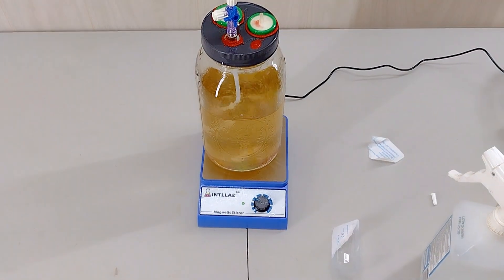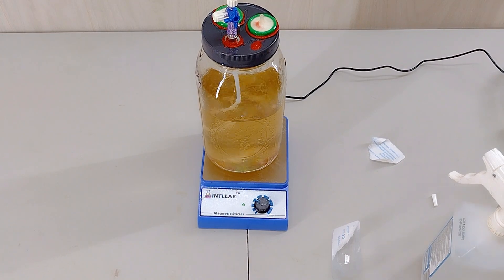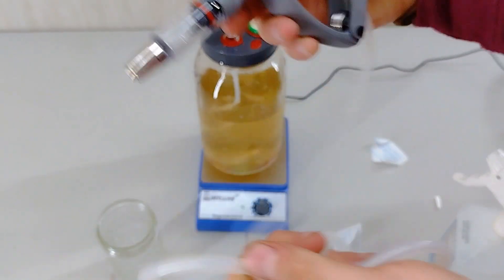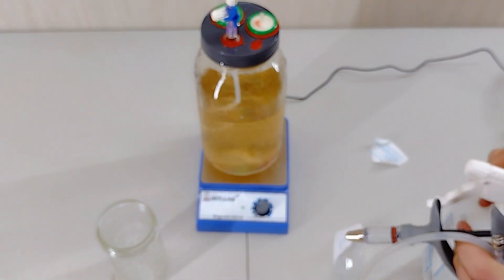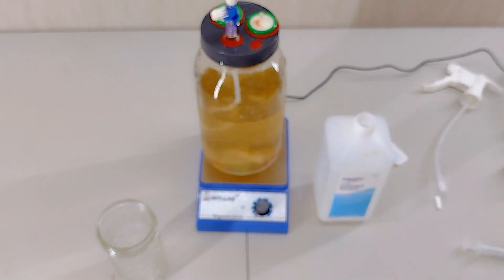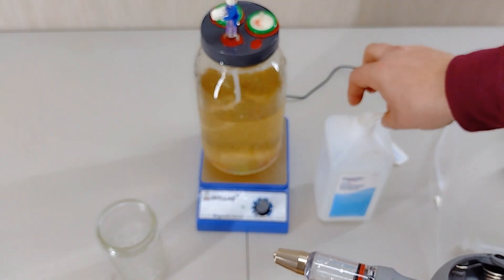Now that we have that on nice and tight, we can get ready to put our continuous syringe on. But first, we've got to sanitize it. So, the way that we're going to do that is, we're going to take off the lid off our isopropyl alcohol, and we're just going to put the tube right in there.